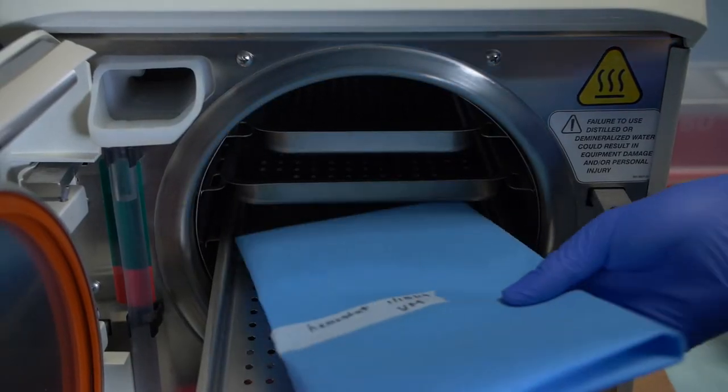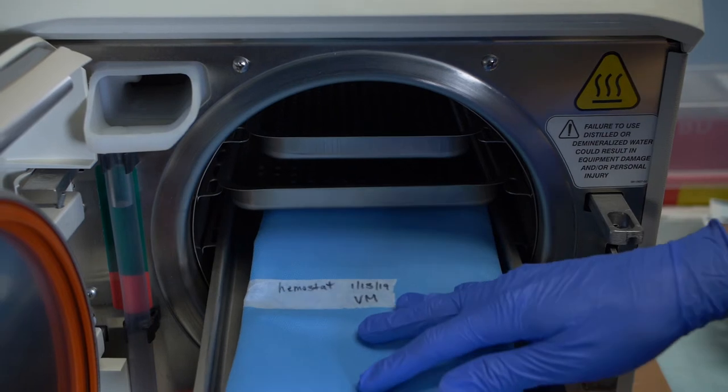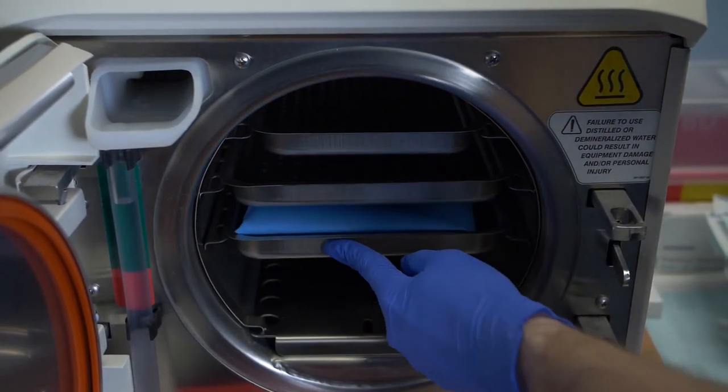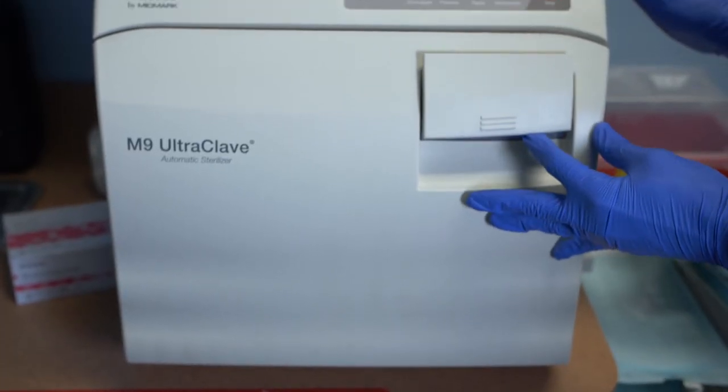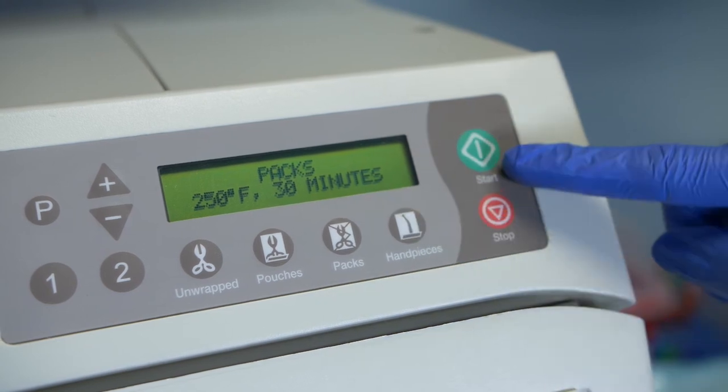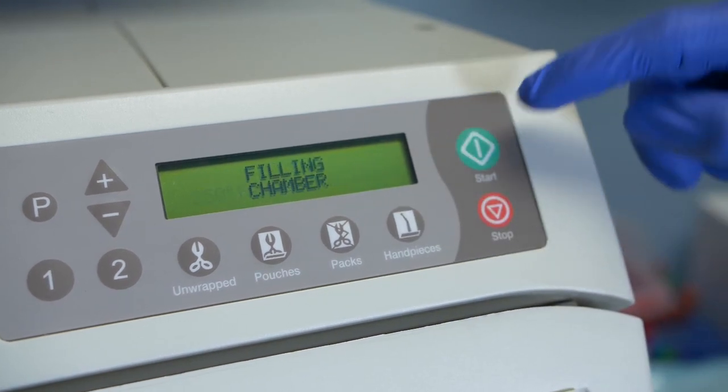Load the packages into the autoclave tray in such a way as to allow for the steam to circulate around and through them. Close the autoclave door and seal it. Turn on the autoclave. Begin the necessary exposure time by setting the timer.